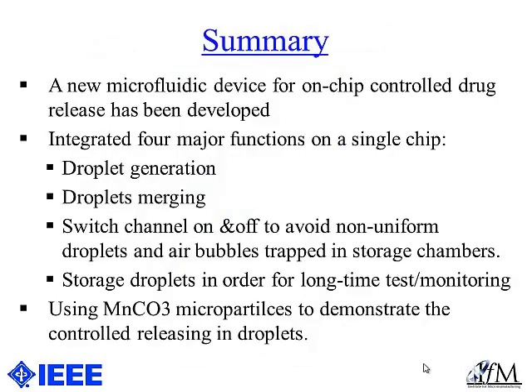To sum up, we introduced a new microfluidic device, integrating several functions into a single chip. We also store droplets in order for a long time for monitoring and testing. And we also use manganese carbonate microparticles as a drug model to demonstrate the controlled release in droplets.